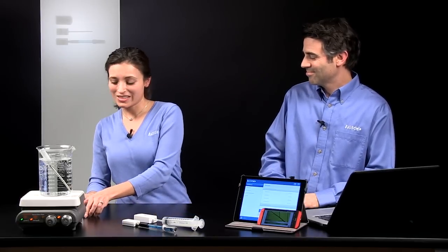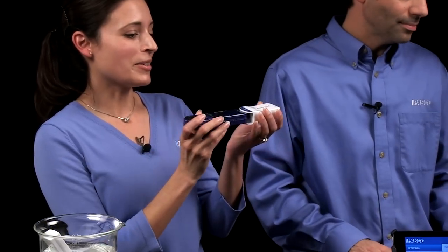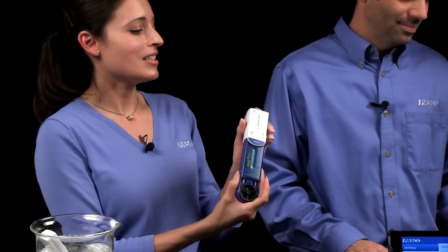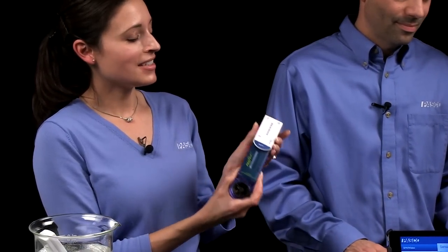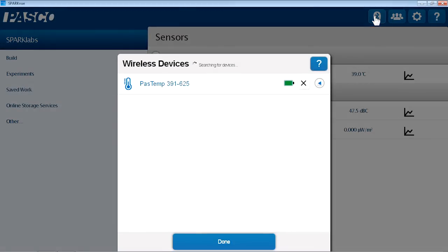And for your sensors that you already have, you can connect an existing passport sensor to an air link and make it a wireless connection. We turn on the air link. And once that's on, just like I did before, I'll connect via that Bluetooth icon.